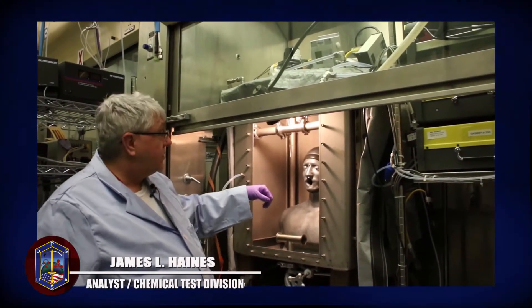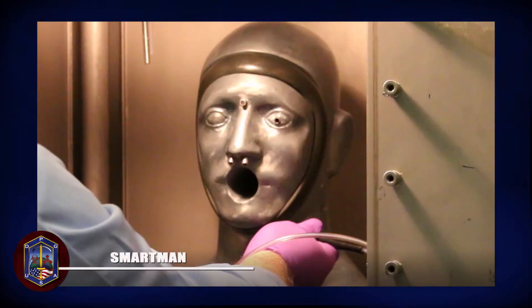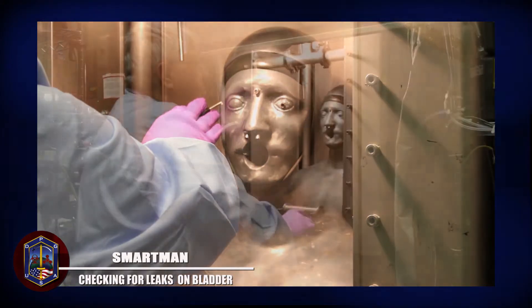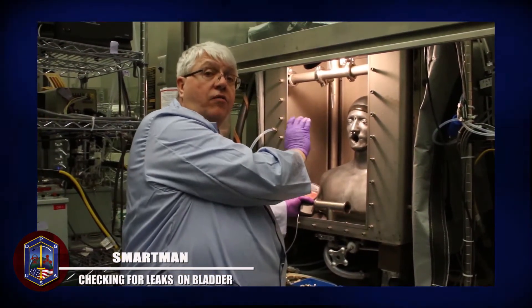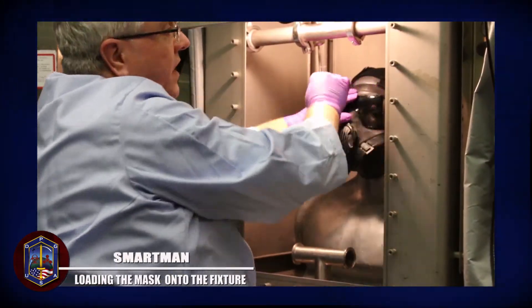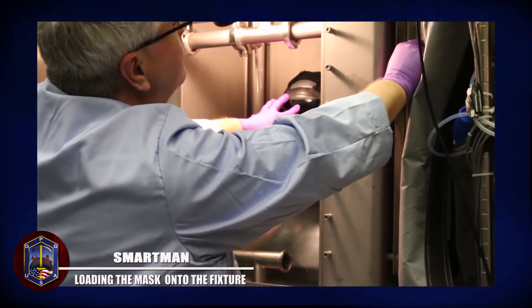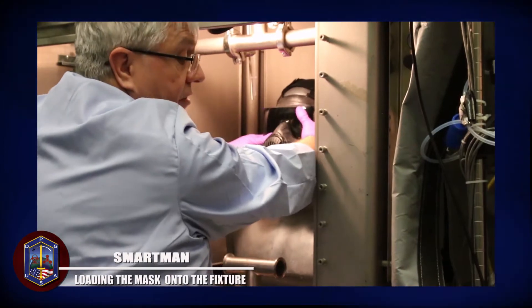The first thing we have to do is load this butyl gasket onto the head form, and we will look for a leak, but we have to have this sealed first before we can actually load a mask. Because it is a face seal, the bladder is inflatable, and we are going to bring it up and inflate that bladder inside to create our seal.